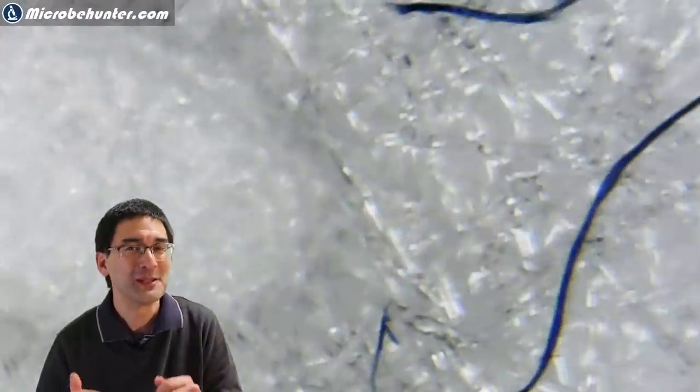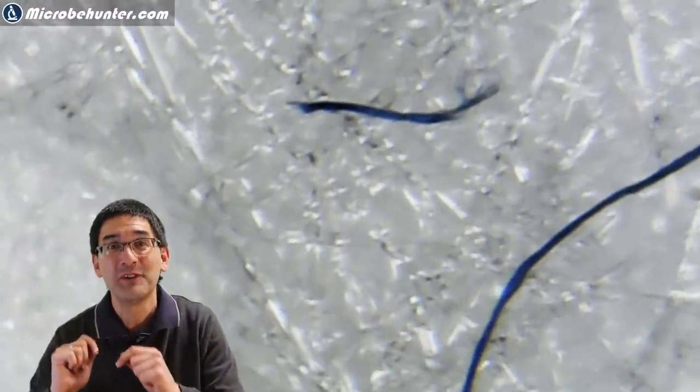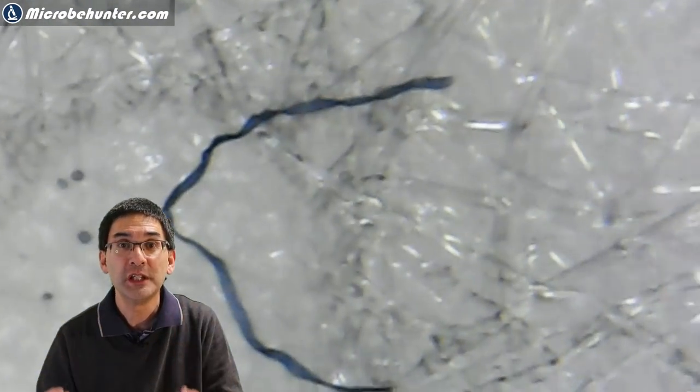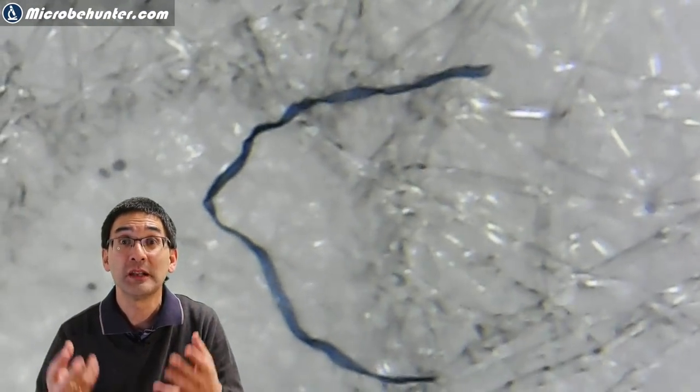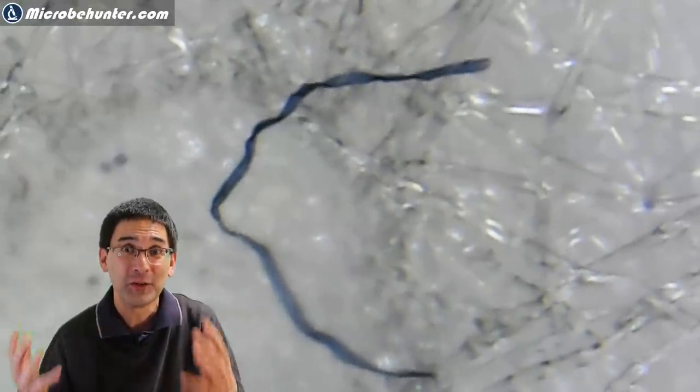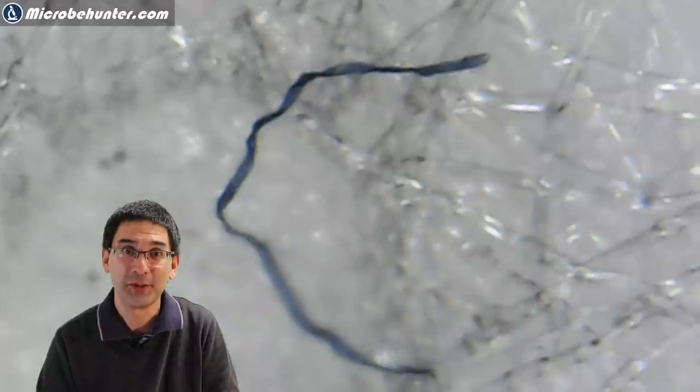It's quite straightforward and simple but I want you to watch to the very end of the video. At the end I'm also going to show you how real live worms look like under the microscope and you're going to see that they look very different than those textile fibers.